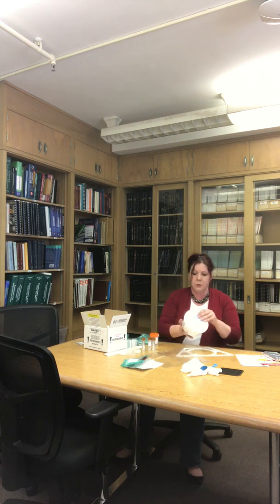And then they can prepare the specimen collection system, and you'll be providing this to them at their orientation session. The reason we only give them 1 is because they are reusable due to the use of these cold water soluble bags. And there is 1 in each kit. We also provide an extra one just in case. If any liquid, aka urine or toilet water, gets in touch with this, it starts to break down immediately and turns into a real goopy gloppy mess. So if they run into that, they can just pull the bag, flush it down, and start again with their spare bag.